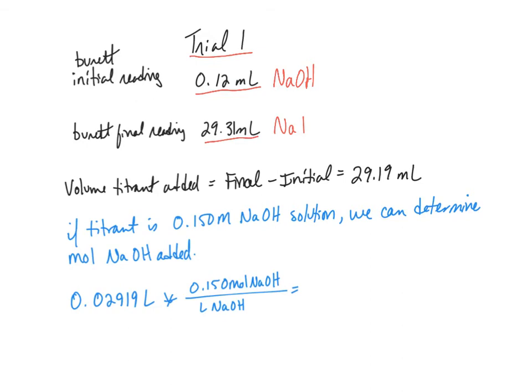I didn't talk about this, but the numbers are backwards on burettes, and that's for a purpose: when you subtract your final minus the initial, it's still a positive number. Don't worry about it. It's really not that relevant for the numbers that we're doing right now, but just letting you know about that. So here's what we do.